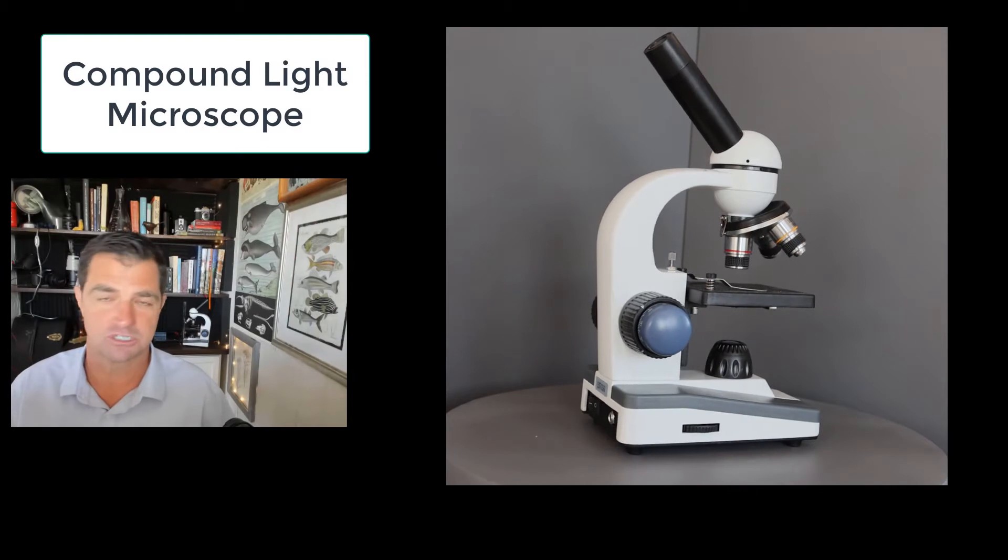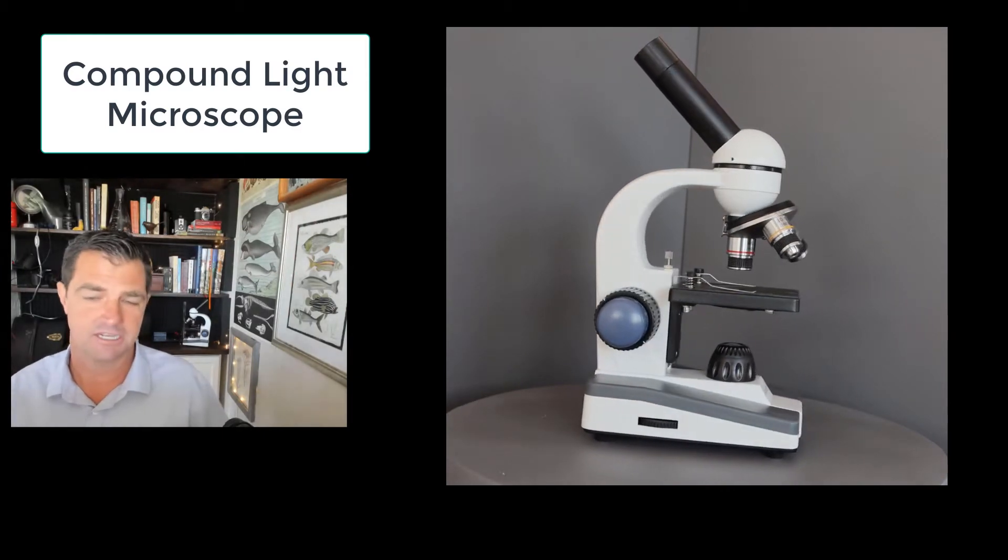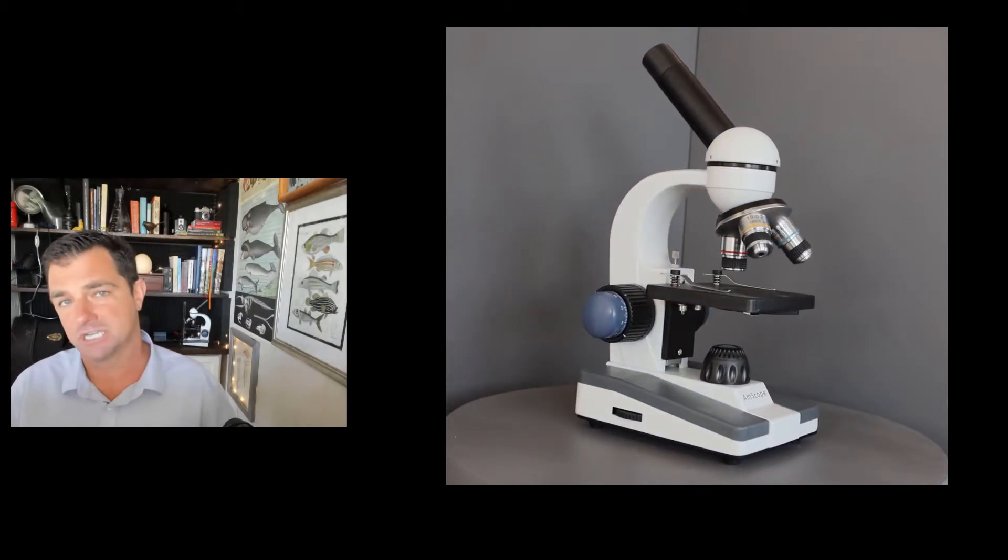Hi everyone. Today I'm going to show you how to use a microscope. There are several types of microscopes available, but the most common type that we use in most biology classes is one like this, which is called a compound light microscope.